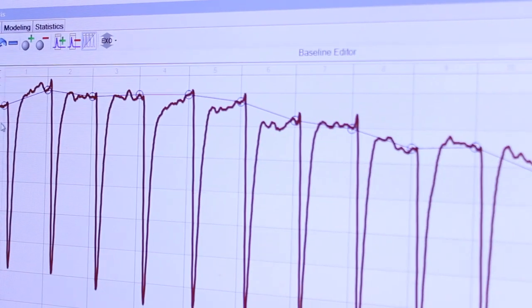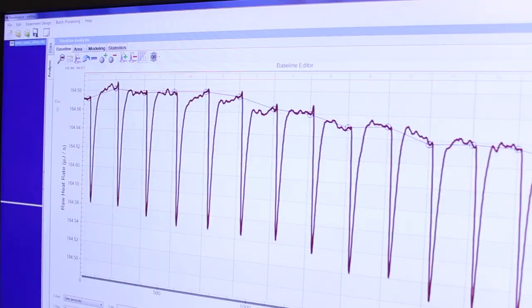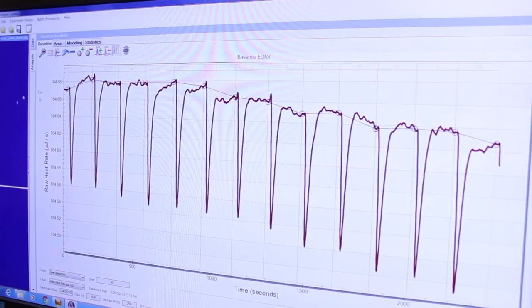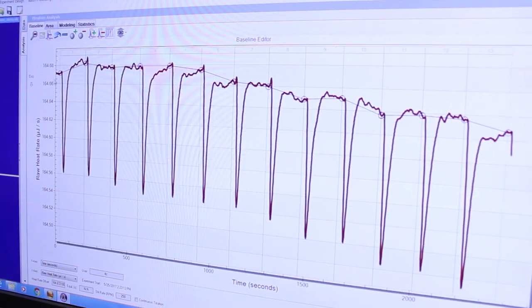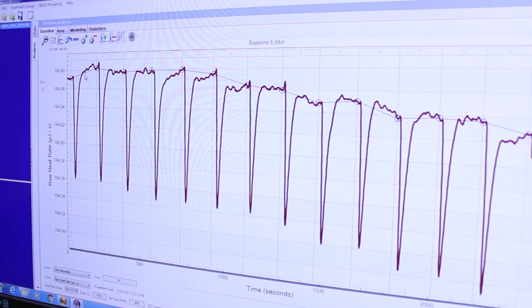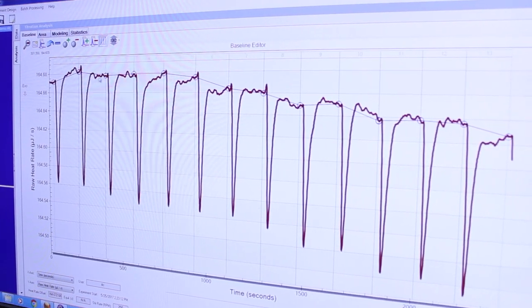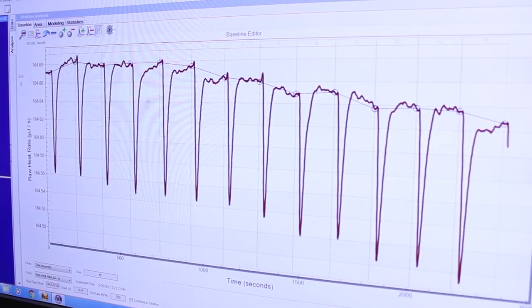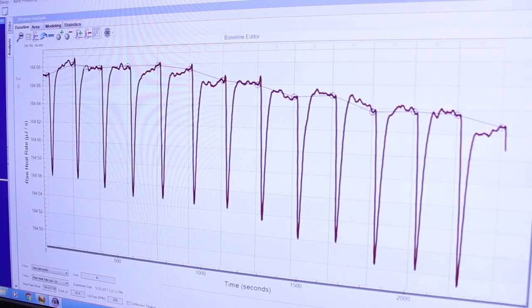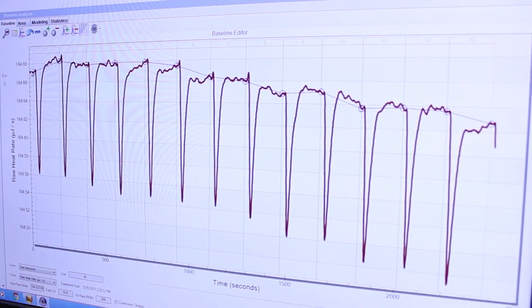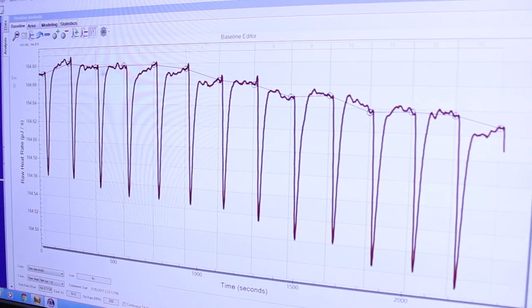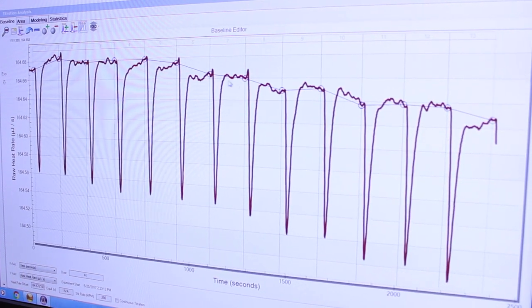And the raw data is the nitc data so I will open the data set and we can pull up the curve of what we might typically expect during a water water titration. So what we see here is a dip associated with each injection.